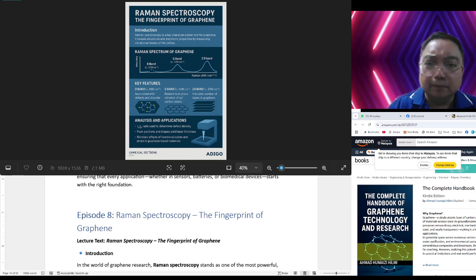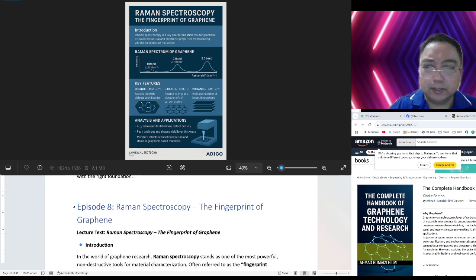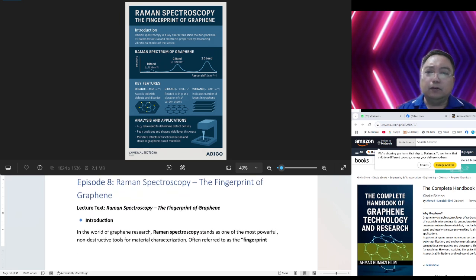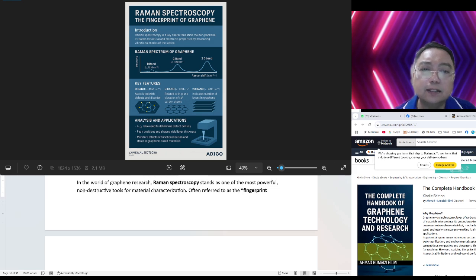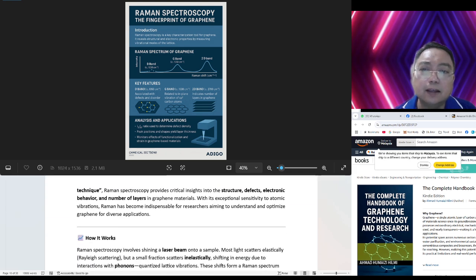Okay, the content. Episode 8, Raman Spectroscopy, the fingerprint of graphene. Introduction: the world of graphene. Raman spectroscopy stands as one of the most powerful non-destructive tools for material characterization, often referred to as the fingerprint technique. Raman spectroscopy provides critical insight into structures, defects, electronic behavior, and number of layers in graphene materials.